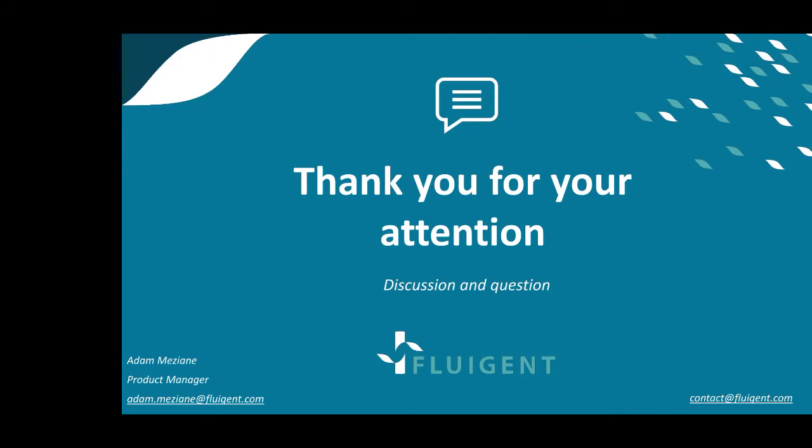Another question. You mentioned a surfactant is necessary for stabilization. Yes. So the role of the surfactant is to stabilize an emulsion after production. If you want to keep your emulsion for days, or hours, it depends, you need to add a surfactant in your solutions. However, the technology that I presented does not need any surfactants for droplet generation. This is the small difference.